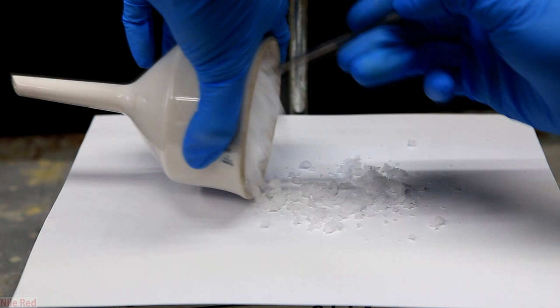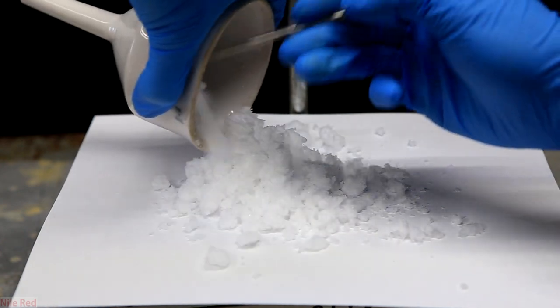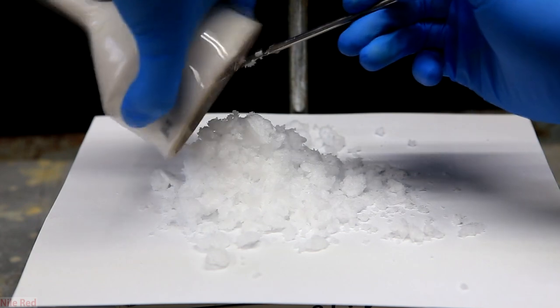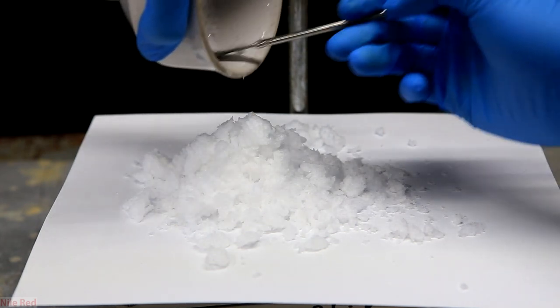I scraped out all of the salt from the Buchner funnel and this is the final yield. Based on the amount of ammonium carbonate used, the yield should be quantitative. Or in other words, it should be pretty much 100%.